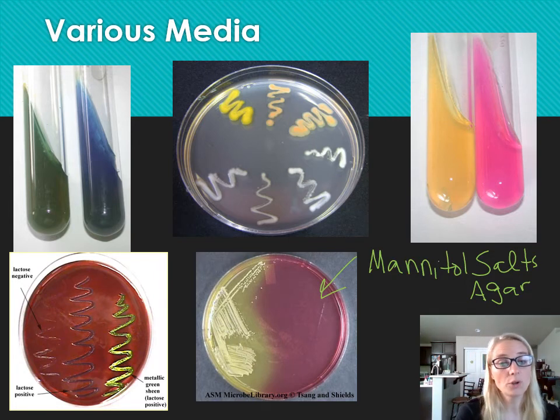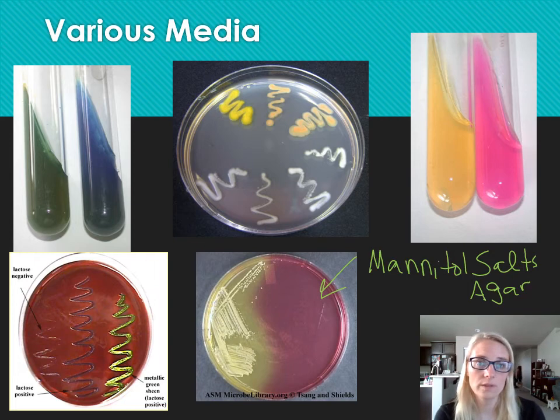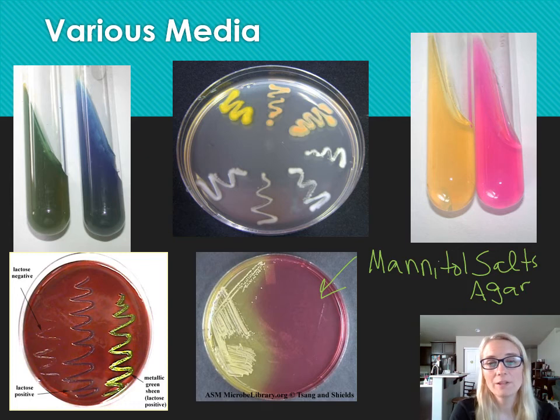Differential media, this is also a differential media because can you tell the difference here between the appearance of the agar? So some agar or media, I should say, because it's not always agar, of the bacteria that can grow, it turns colors. Either the bacteria itself turns color or the media itself turns colors. And I'll talk about some of these other examples in a little bit. But mannitol salts, it's selective for halophiles, but it's differential for halophiles that can ferment mannitol. That's the mannitol part.